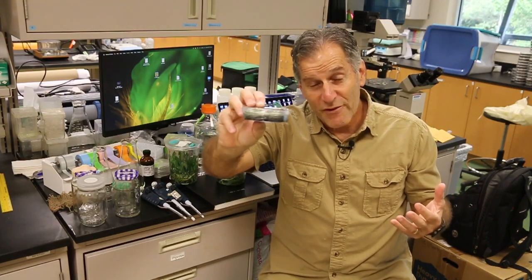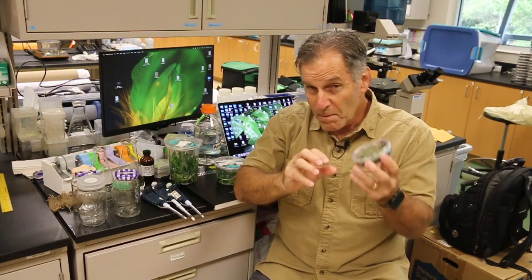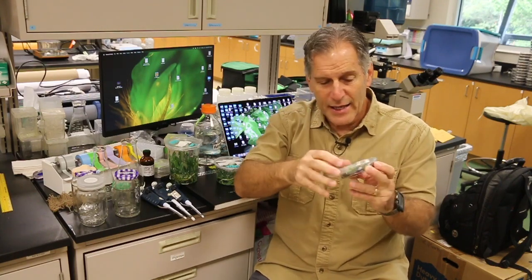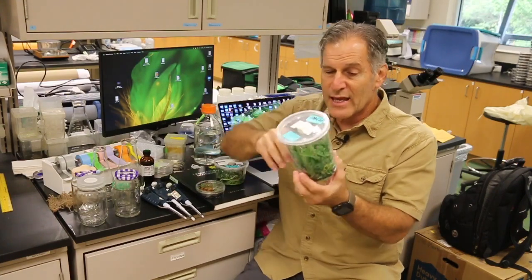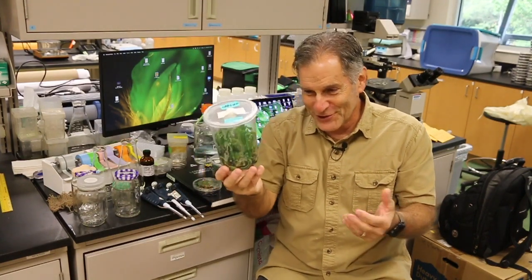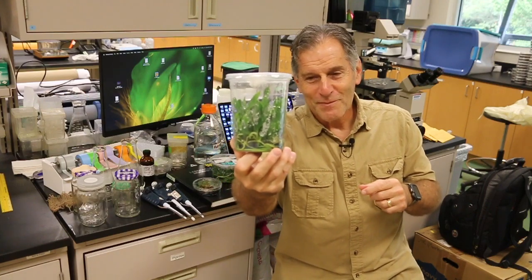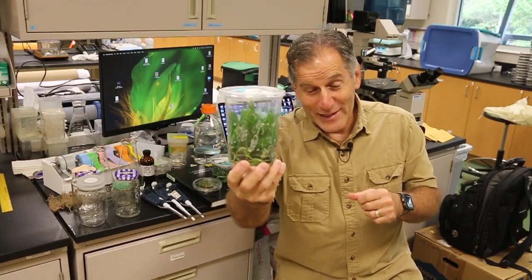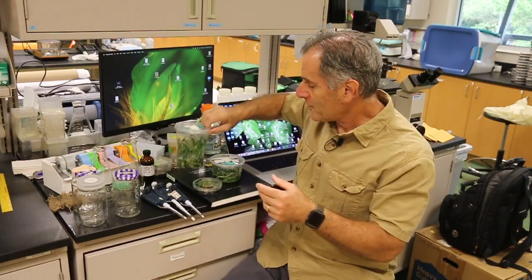These are 100 by 25 millimeter petri dishes, a little more expensive than the smaller ones, but I like the height for a lot of the seedlings that I'm generating. And again, these are relatively cost efficient, but I really like these because look how tall these orchids can grow in this container, in this flask, even though it's not a flask. Okay, so I just wanted to give you kind of an overview of flasking.